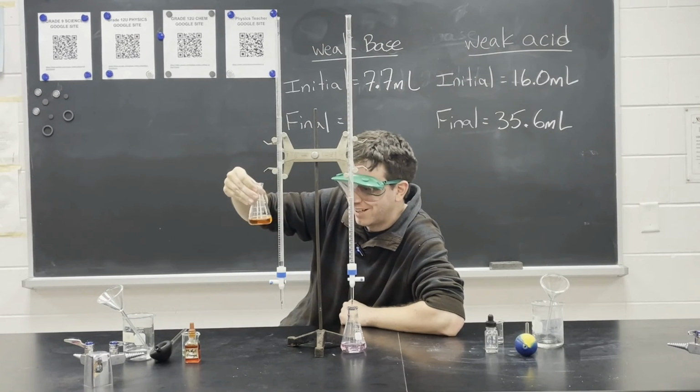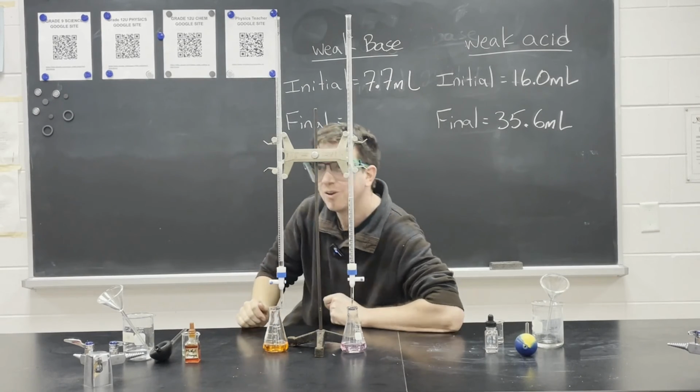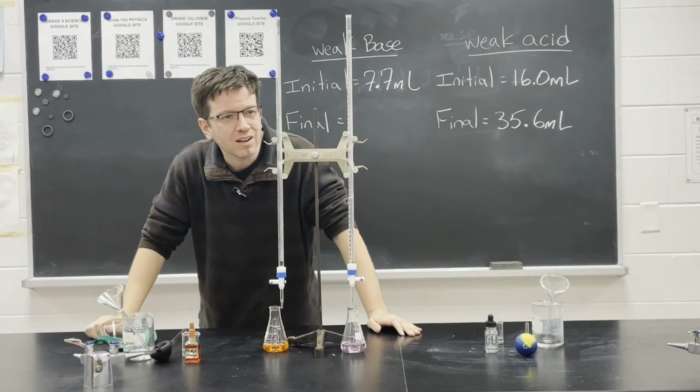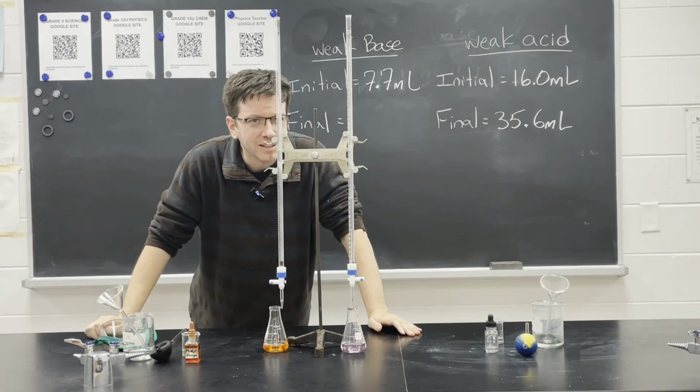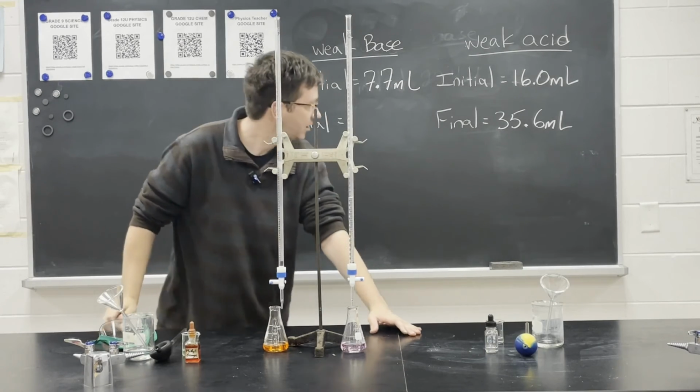There's our orange color. All right. Let's see what we're at. Oh, exactly 18.